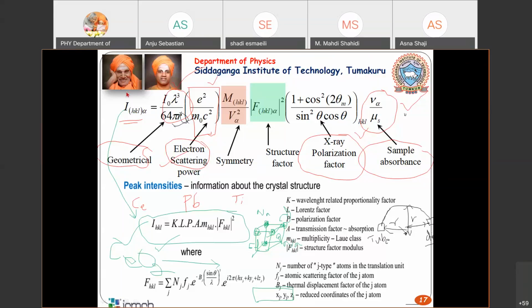We need to give all this information into the program, and we will see how to do that later. So cerium would be 0.9 and zirconium will be 0.1 in that case. If you are taking pure cerium, then cerium will be 1 and O will be 2. These are the numbers of atoms which are present in your sample.